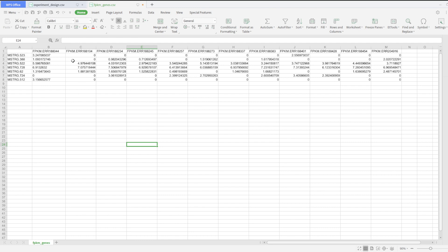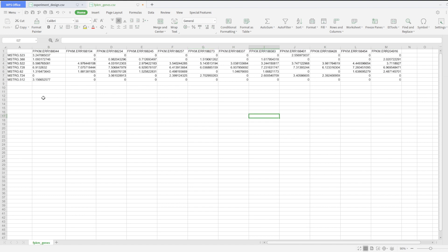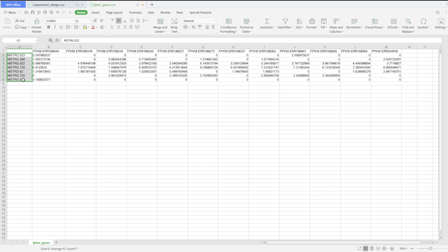So I have some information here — these are differentially expressed genes. The table has information about the genes and their respective gene expression values. I'm using FPKM values here, which are normalized weighted counts, and I also computed the log2 of the values. These genes are differentially expressed; this data is a subset of a bigger dataset which I have covered in another tutorial.